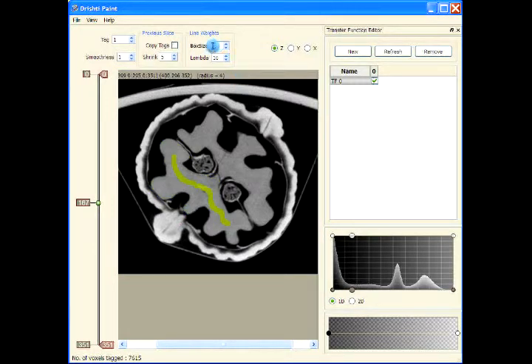Now what the box size does is it basically uses that parameter, 5 or 10 or whatever you give in, to decide the average gradient in that region.